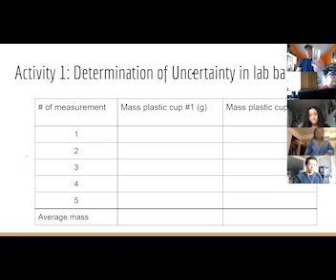So we're going to measure 1 five times. So we'll just put it on there. Now what you also want to do is don't write down the first number you see. You will notice it's changing. Why is it changing, do you think? What kind of mass are people getting? 9.38.